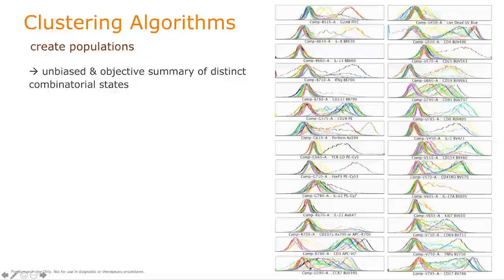But then in other cases, like CCR7 or CD95, you have a continuously variable expression pattern, and there are intermediate levels of expression. That is, there are populations there that are transitioning and upregulating and downregulating the marker to do a different function, whether that's trafficking, cell death, effector functions, exhaustion, whatever.